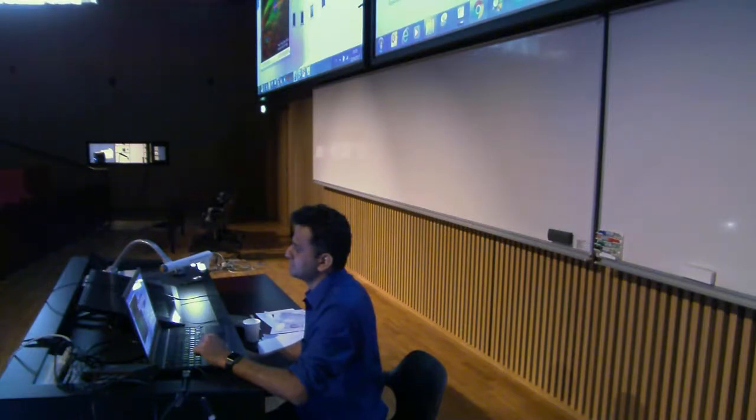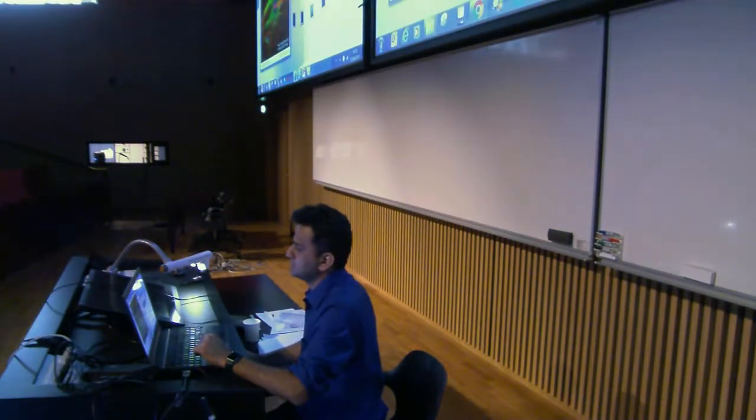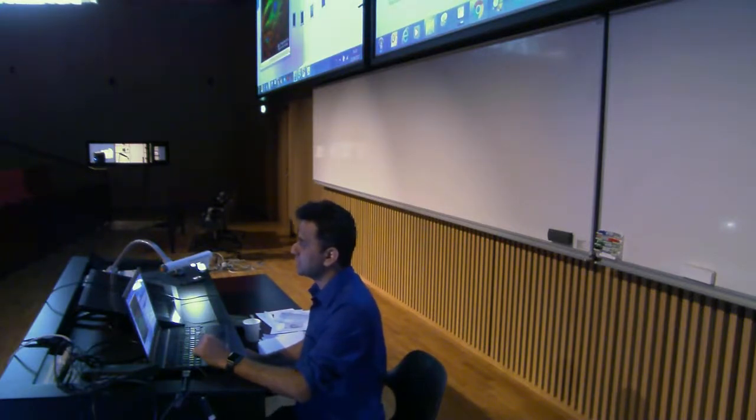What you do actually is just go here, Edit, Selection, say Select None. Close. I'll just open the new one, the fluorescent cell. And I do not like this because this is actually a part of an image. So you cannot delete this. This is not overlay. This is the difference between overlay and annotation, okay? Because this is an annotation.